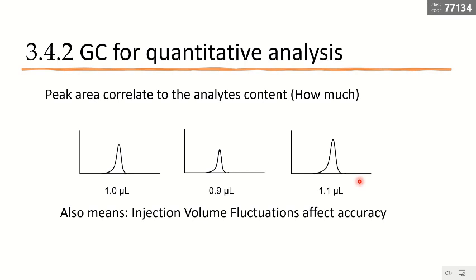If I'm going to inject my sample, maybe 1.0 microliter, and my friends also 1.0 microliter, we think we are injecting 1.0, but maybe it's not exactly so. With some human error when we do our sample preparation, it still fluctuates. Whatever factors affect our accuracy, right? Wow, that means my test result may not be accurate, which worries some of us, or most of us, or even all of us. How are we going to handle this concern here?